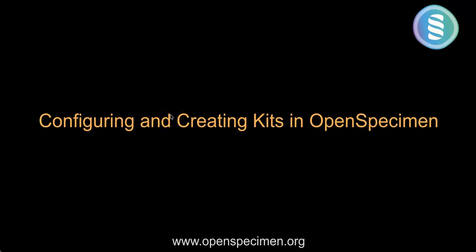Hello everyone, this is Ankita, and in this video, I'll walk you through how to configure kits and create kits in OpenSpecimen. So we'll cover four parts here.